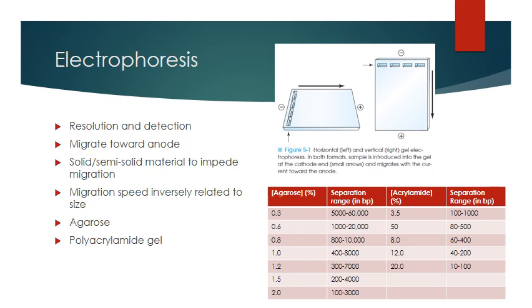Now we would separate them following maybe treatment with some kind of restriction enzyme that allows us to cut that DNA into the sizes that we're interested in.